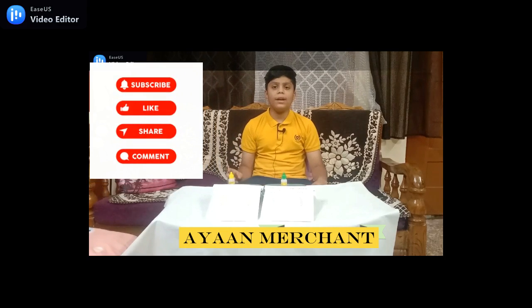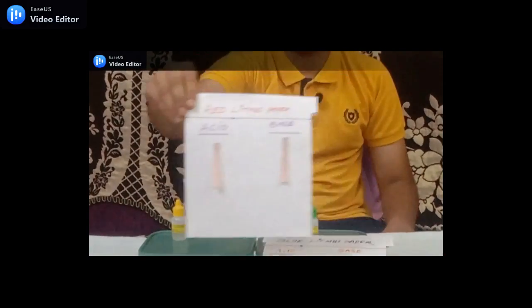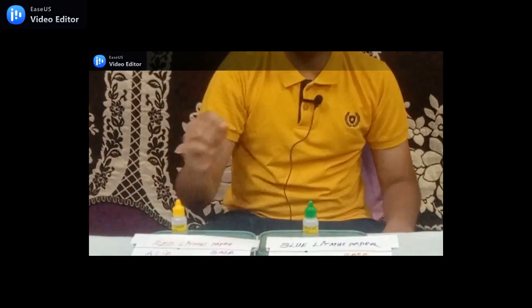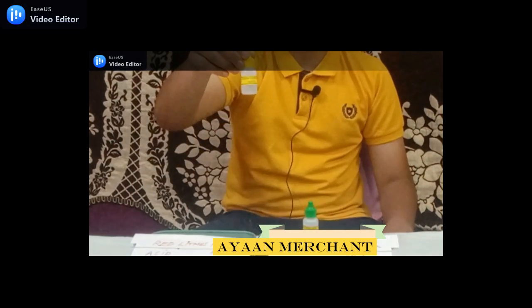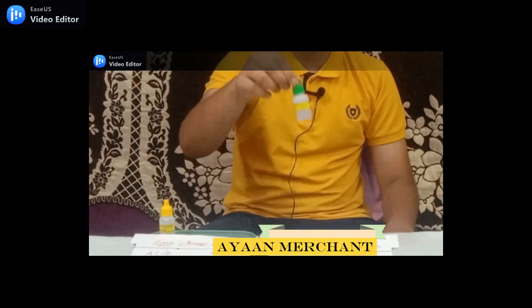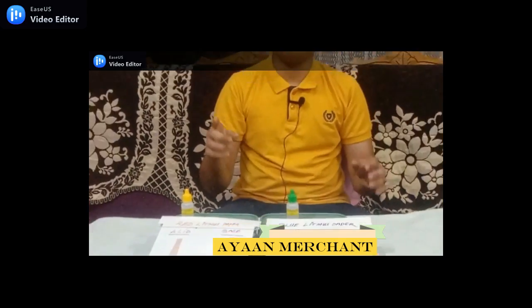Hi friends, today I am going to show you how to test acid and base using litmus paper. To perform this experiment I have red litmus paper, blue litmus paper, a chemical base sodium hydroxide (NaOH), and I also have diluted hydrochloric acid, formula HCl. Now let's start the experiment.